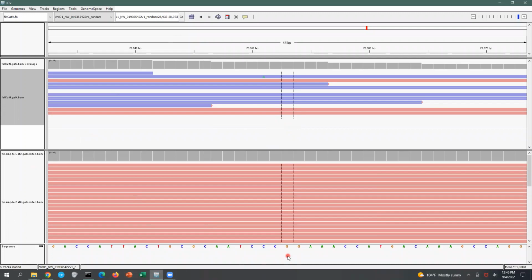So with this reprocessed data, reprocessed using open source programs, which means free programs available to the genomics community and anyone who has the ability to run the code and do the analysis, then you'd come to the conclusion with the reanalysis of raw data that she had 0 copies instead of 2 copies. And indeed, the most recent Basepaws reports have made that change. And I believe that is what they would like to acknowledge me for.